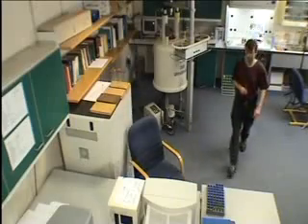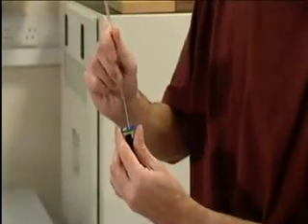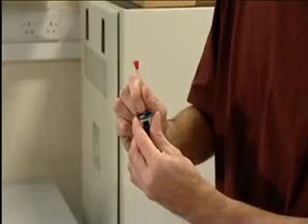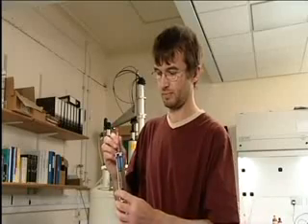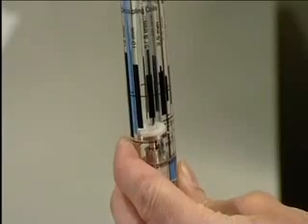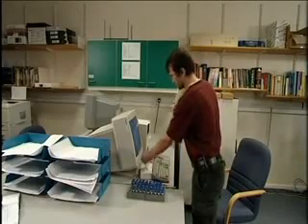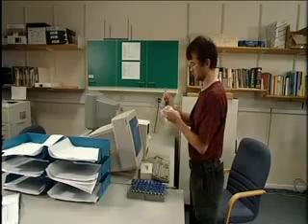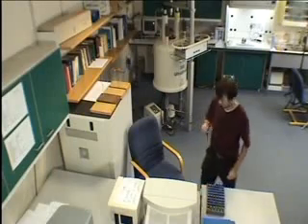Inside the instrument, the sample sits on a cushion of gaseous nitrogen. This plastic spinner has vanes that turn in the flow of nitrogen and spin the sample. The spinner is placed on the tube in such a position that the sample tube will be in the centre of the magnetic field when it is in the instrument. Together, these ensure that the sample experiences a uniform magnetic field.